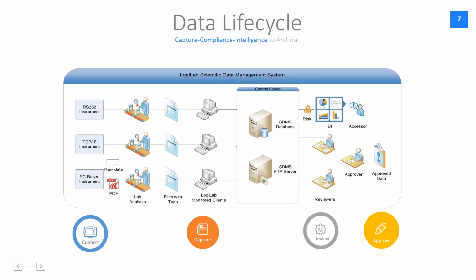Once data is captured, there can be reviewers, approvers of data to check the data generated by different instruments, review them, approve them, and release them in the electronic system and place their electronic signatures as well.